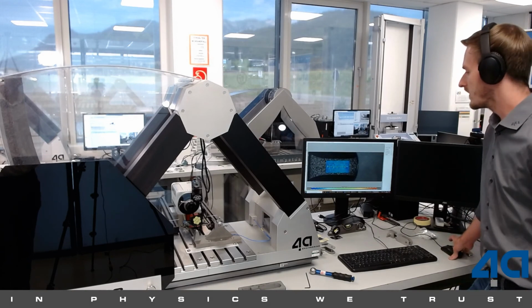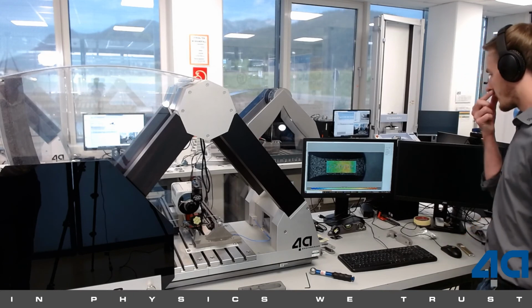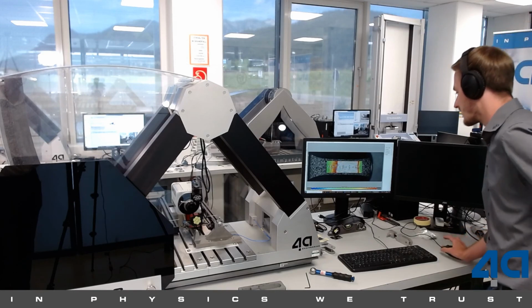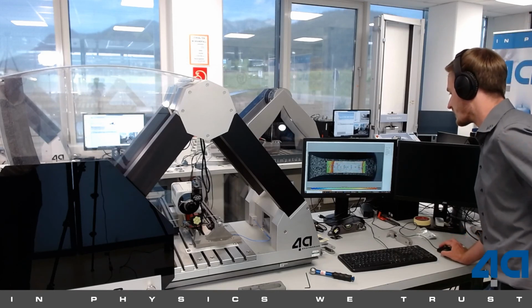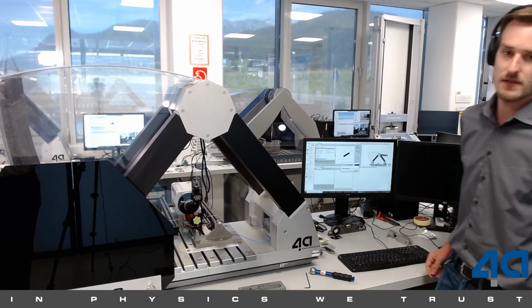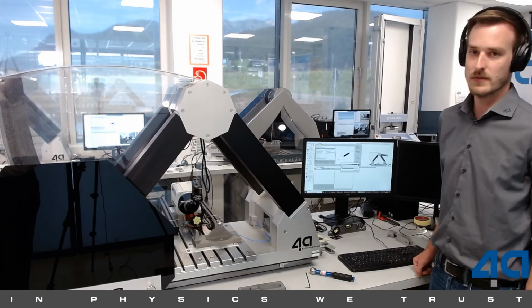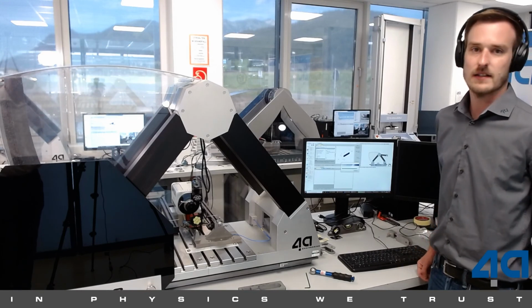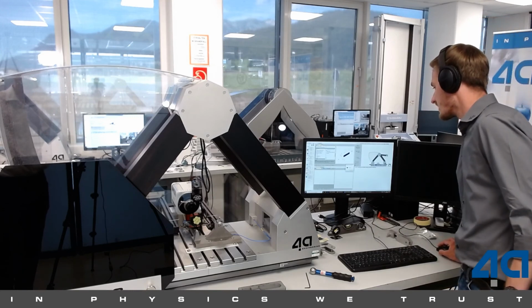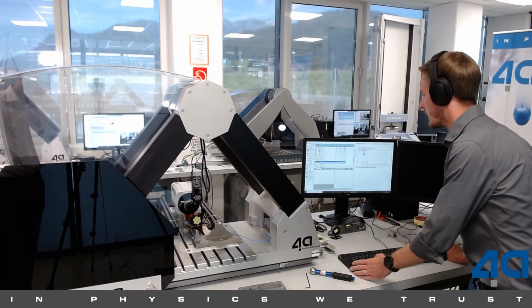We're creating a video automatically of this calculation. And this was finished, and all data now will be copied to the dataset in VALIMAT. So we store all data, all raw data, all images directly in VALIMAT in the dataset. And this is finished. Go to OK. And we now quickly evaluate the test.